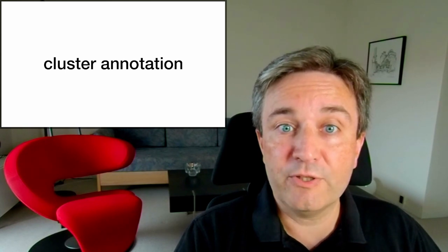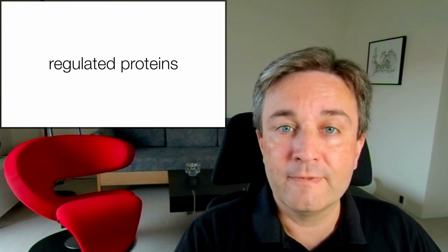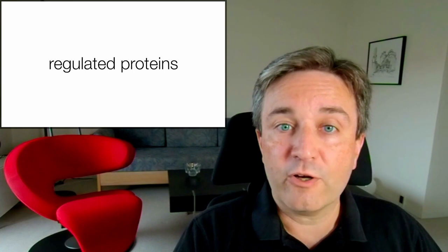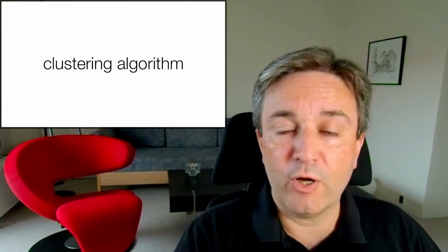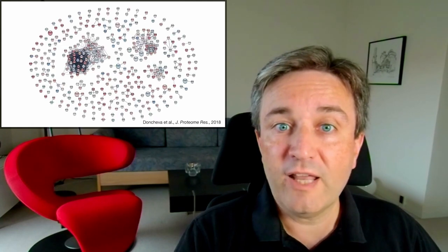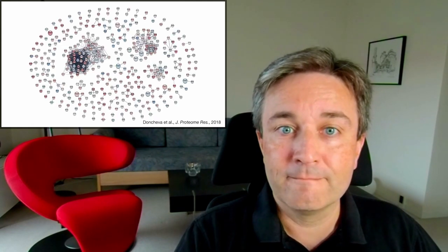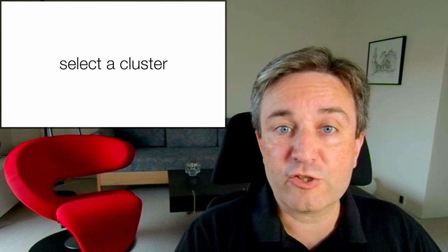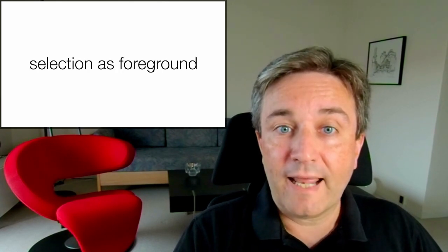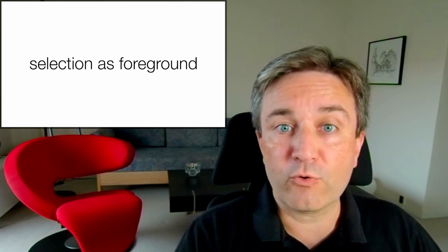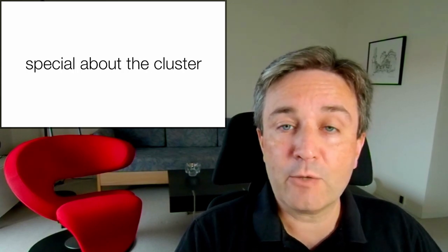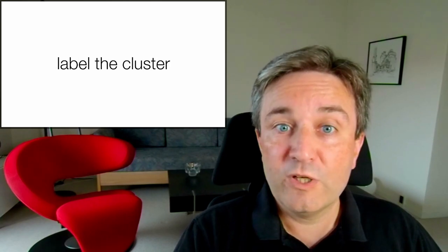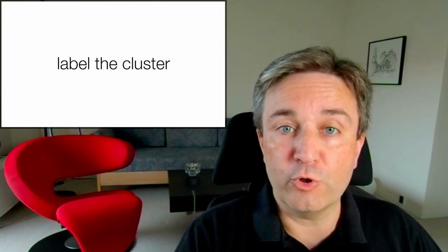A similar approach can be used to annotate clusters. If you have your network of regulated proteins from before and you've run a clustering algorithm on it to break it into functional modules, you'll have a network that looks like this. You can now select a cluster and run enrichment analysis using the selection as foreground and the whole network as background. That way you find out what's special about the cluster, which can suggest which label you should put on it.